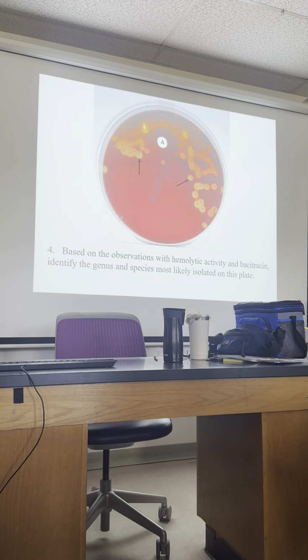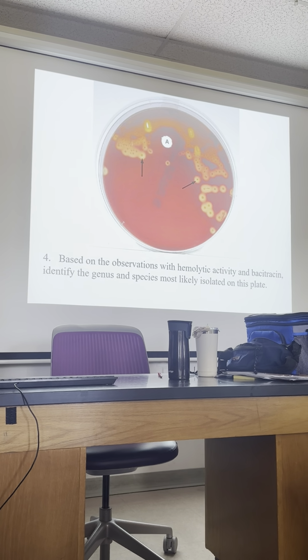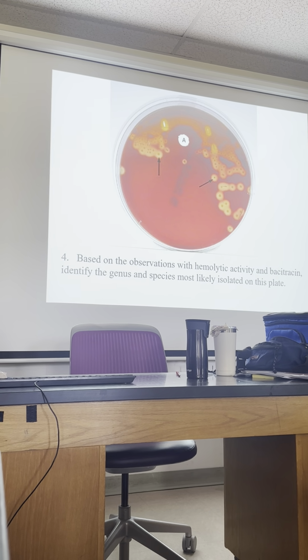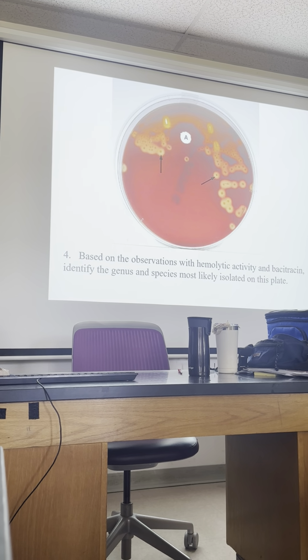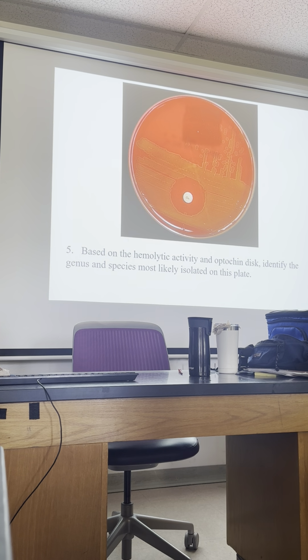So this is a strep or an enterococcus. Which one? Pyogenes. And what group does that belong to? It's group A strep. Okay, good. But you can't say group A strep unless I ask what group this is. If I ask for genus and species, you have to say Streptococcus pyogenes. Okay? Alright, here we go.